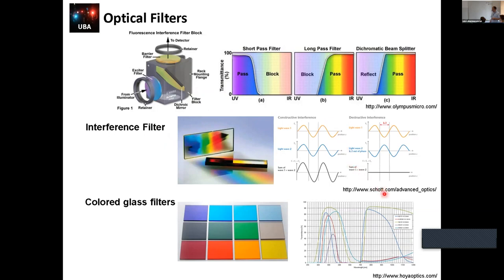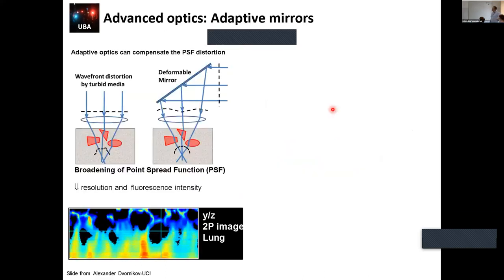But on Wednesday we will see a particular instrument called DIVER, which uses color glass filters, because in this case the photon will be absorbed at certain wavelengths and not at others, and the filter will transmit this light. These filters are very, very useful for this, because we can collect photons under not parallel or collimated conditions.